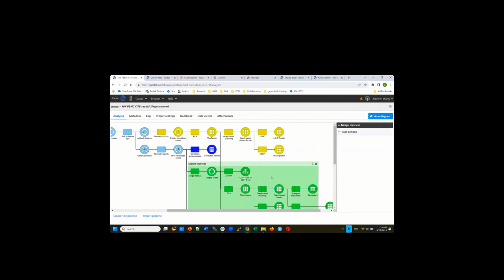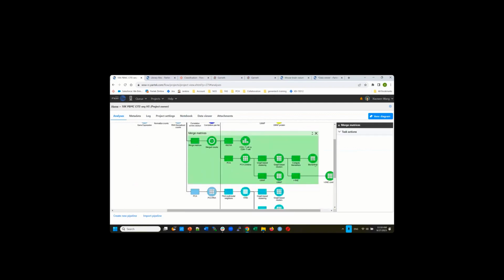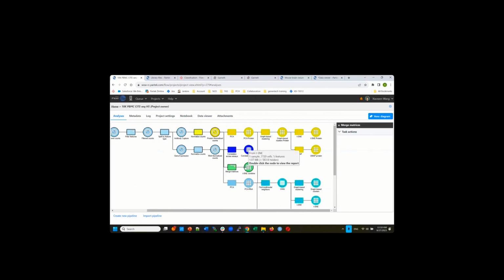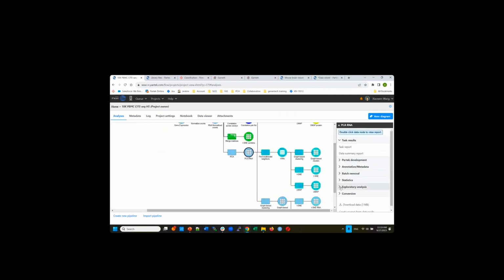And after you merge, on the merged data, you can perform another level of visualization and differential analysis, right? Or another way is to merge only for visualization. If you look at the protein, there's only 17 proteins, and for gene expression there are 10,000 genes. When you merge them together, your visualization, your PCA or UMAP, will probably be dominated by your gene expression, not protein.